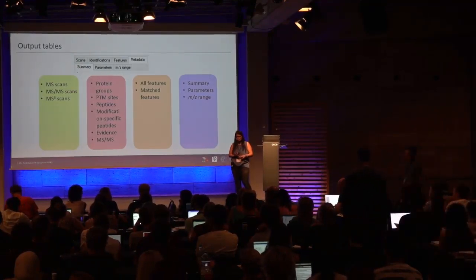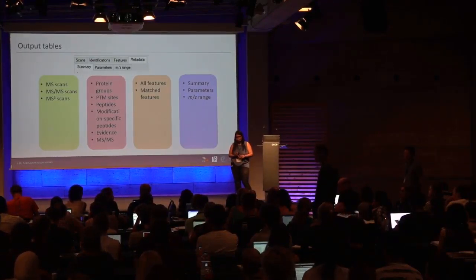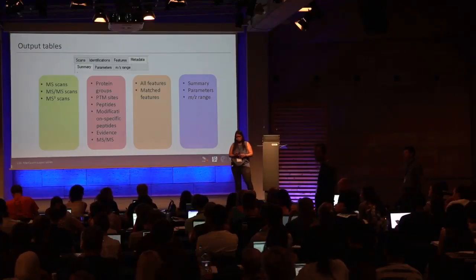So I'd like to look at the non-normalized LFQ intensities, and maybe try another normalization method, or even see if I should exclude some sample that shouldn't be in the normalization.